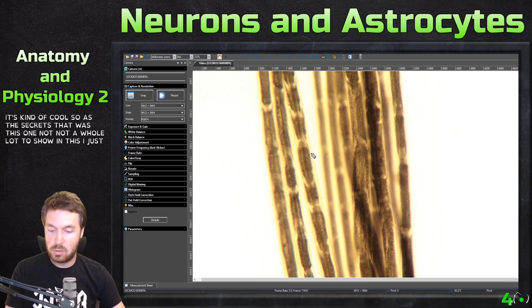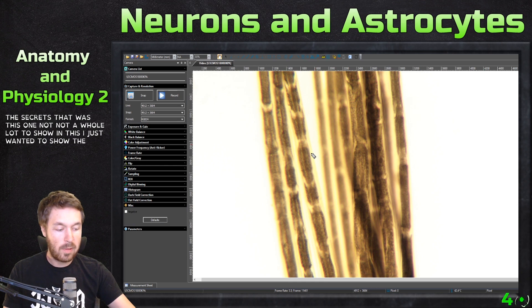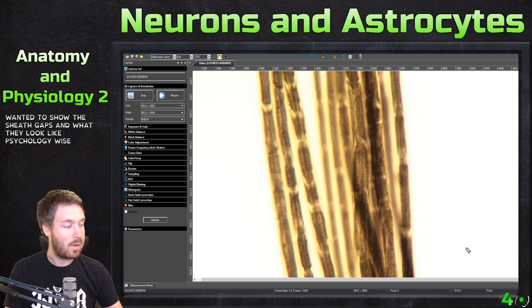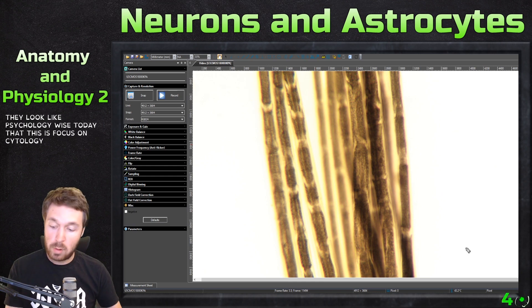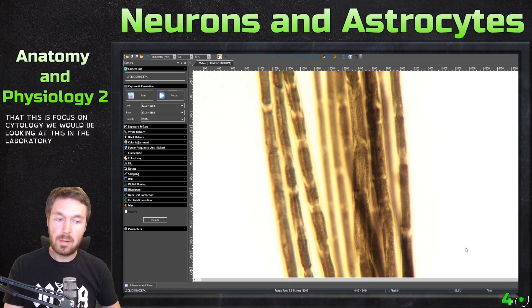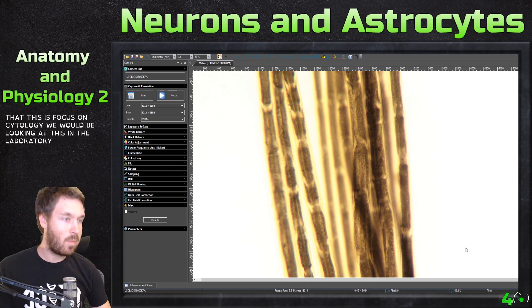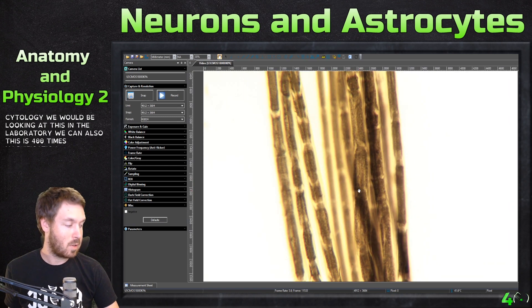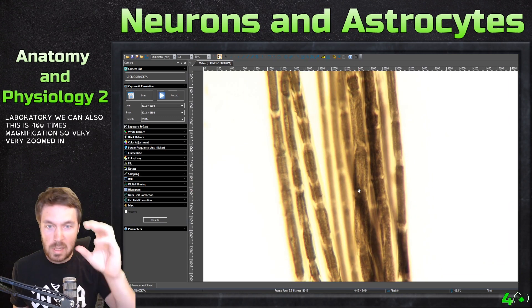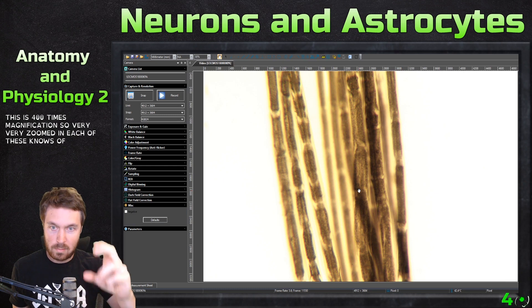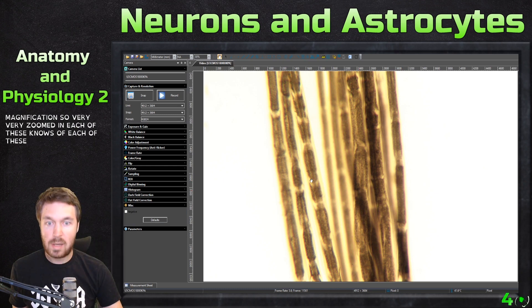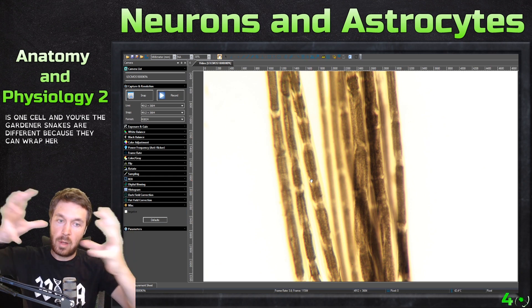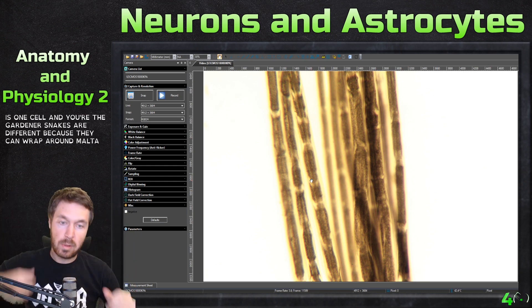There's not a whole lot to show on this. I just wanted to show the sheath gaps and what they look like cytology-wise, because today is focused on cytology. This is 400x magnification, so very, very zoomed in. Remember, each of these Schwann cells here is one cell, and the oligodendrocytes are different because they can wrap around multiple neurons.